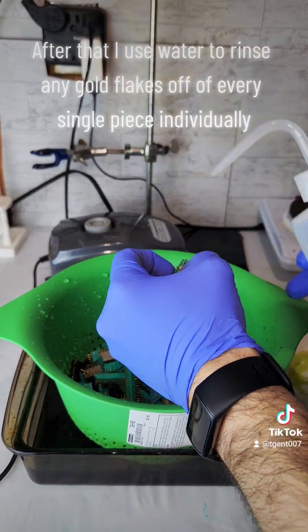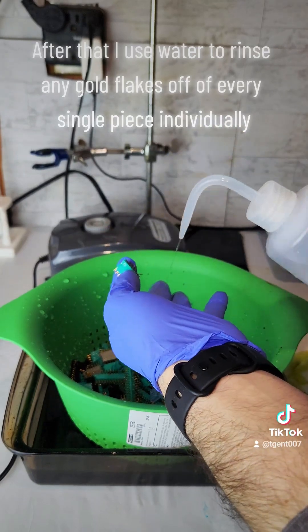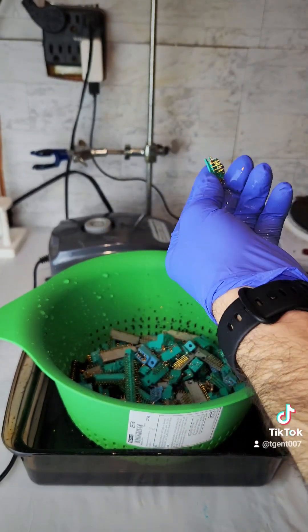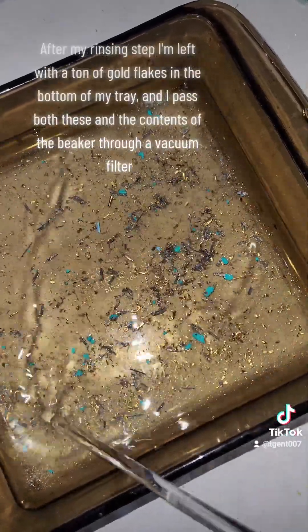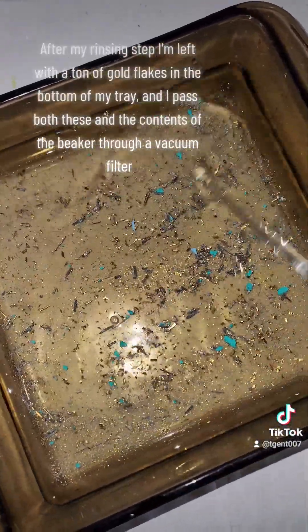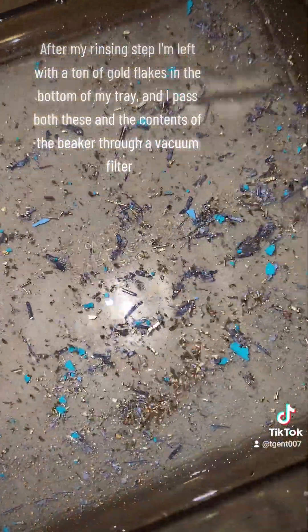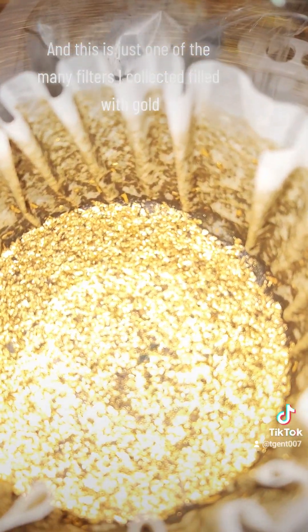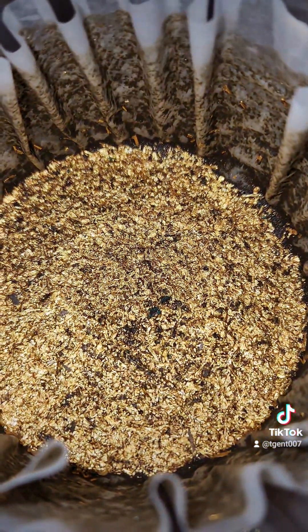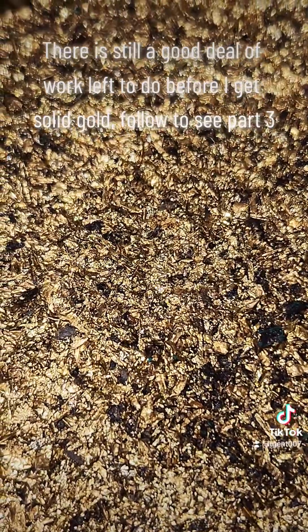After that, I use water to rinse any gold flakes off of every single piece individually. After my rinsing step, I'm left with a ton of gold flakes in the bottom of my tray, and I pass both these and the contents of the beaker through a vacuum filter. And this is just one of the many filters I collected filled with gold. There is still a good deal of work left to do before I get solid gold.